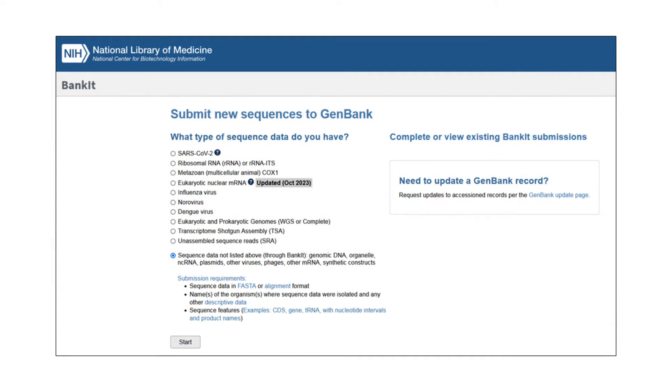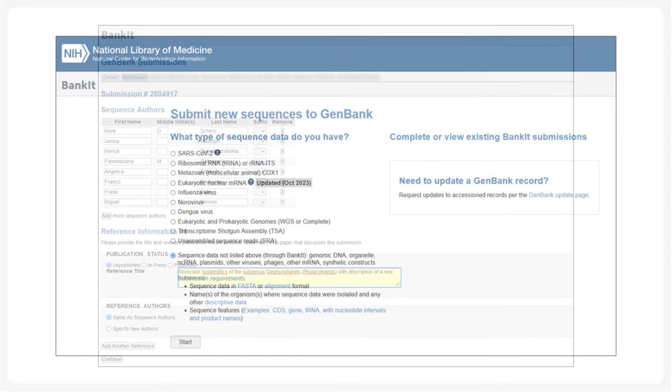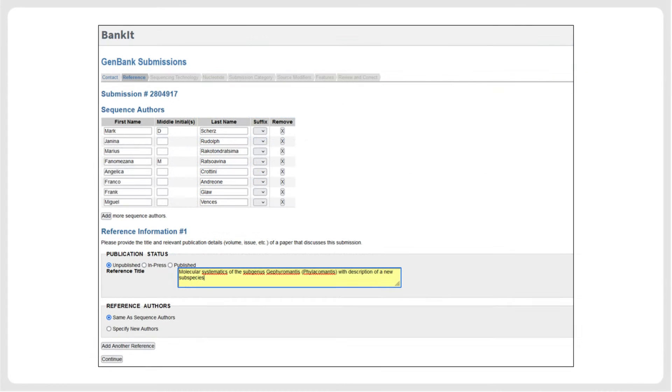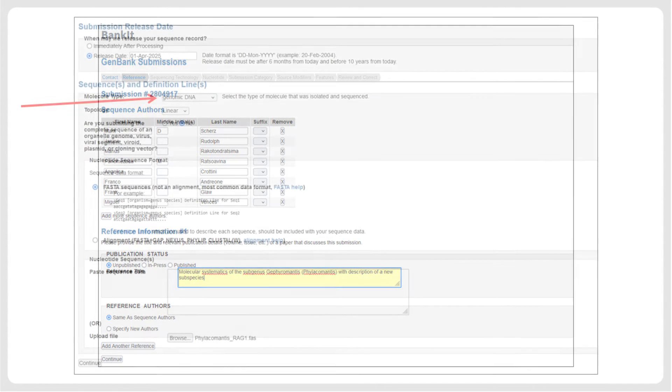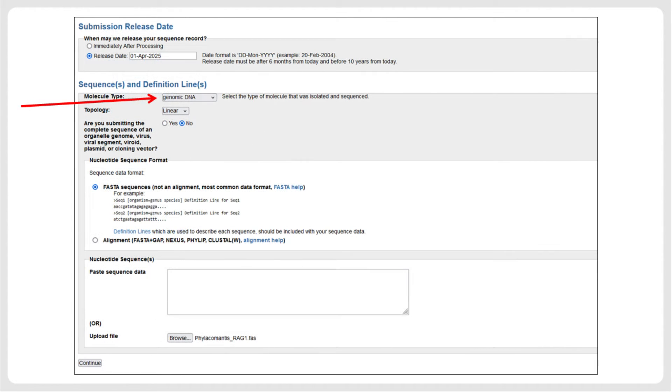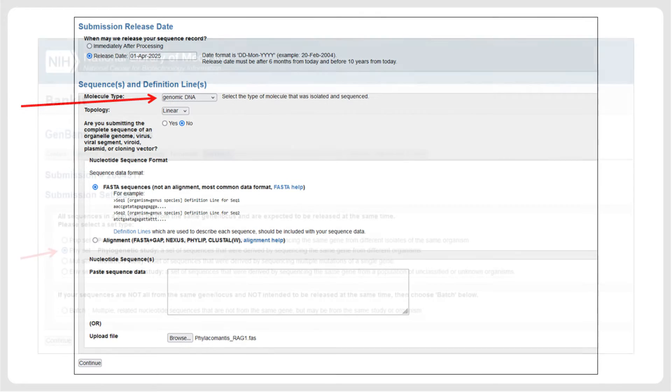Once the FASTA file with sequences and metadata has been prepared as indicated in the previous slides, begin the BankIt submission. In this pipeline, the sequence authors are specified in one of the first pages.